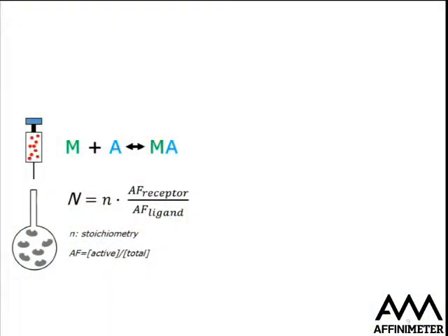So this is a standard experiment where, again, this is a very simple one where you have a ligand in the syringe, macromolecule in the cell, as you have a simple one-to-one model, and you can analyze this experiment, the isotherm, and you can get the binding constant, the enthalpy, and you also can get what is sometimes called the stoichiometry parameter, which, in case you are sure you have a one-to-one model, can be used as a correction in the concentrations.